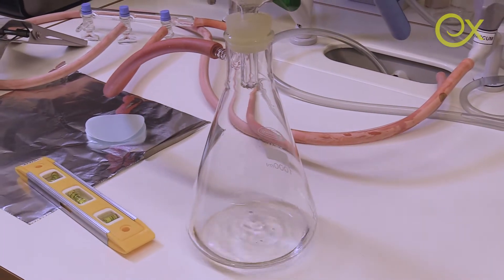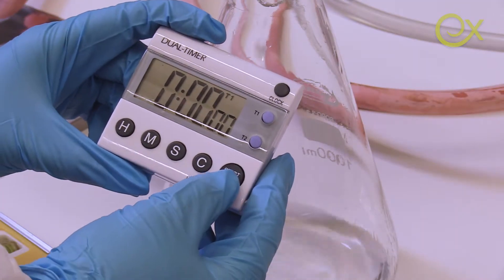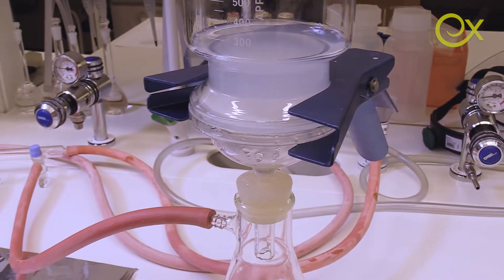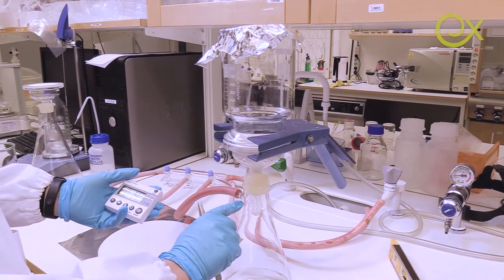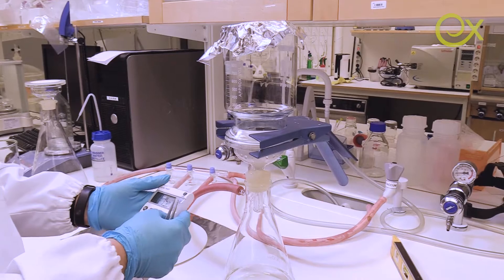We just need to wait a little bit — something like 20 minutes. The filtration process is now finished; nothing is dripping from the nozzle. It took only 15 minutes, which is good.